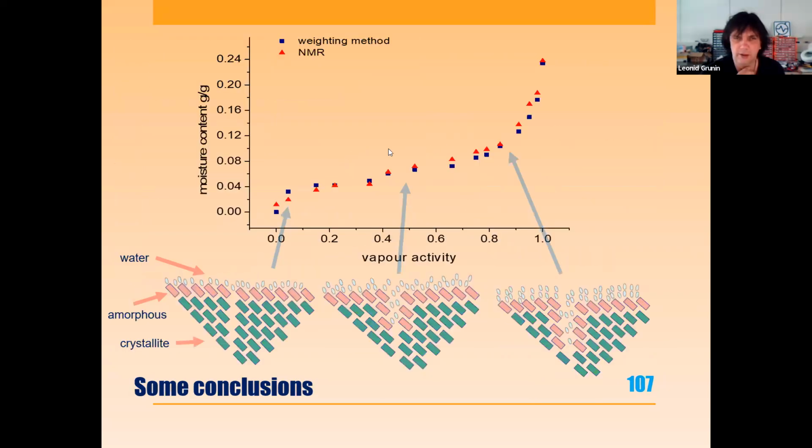Okay, I think this picture is showing you how this can be estimated, how the model looks like at the different stages of humidifying. You see how the structure of the fiber is changing.